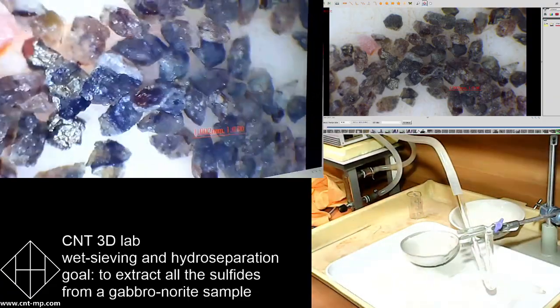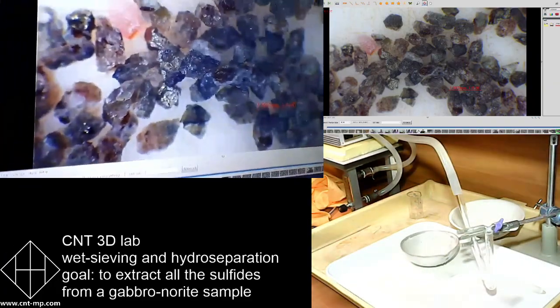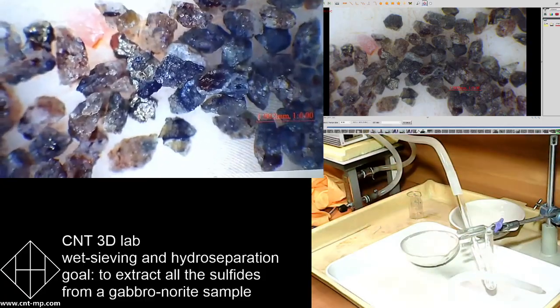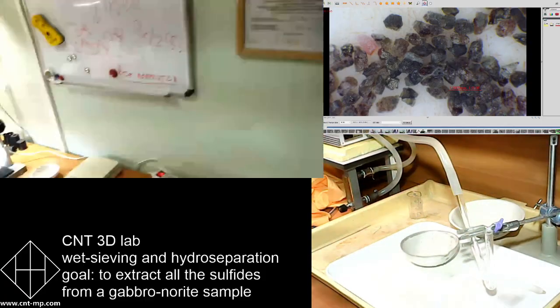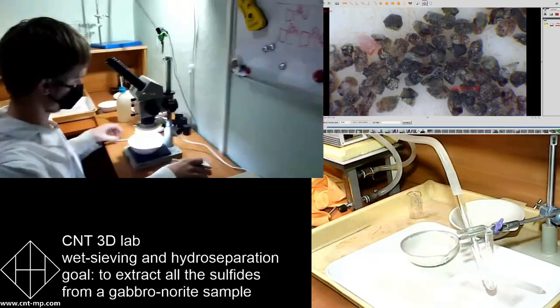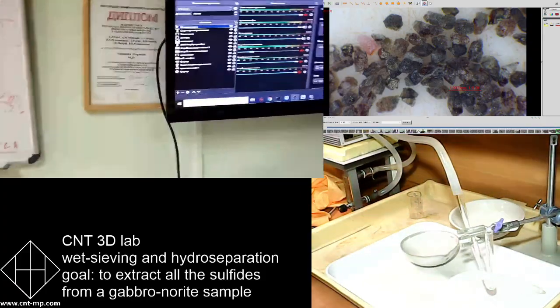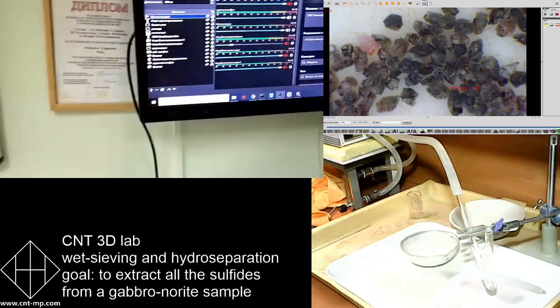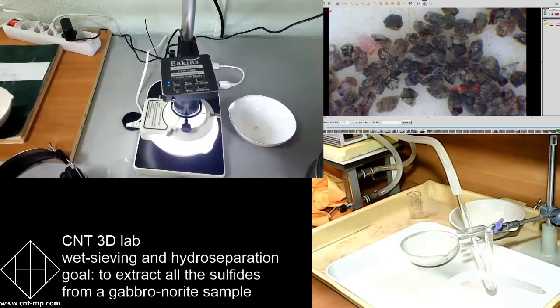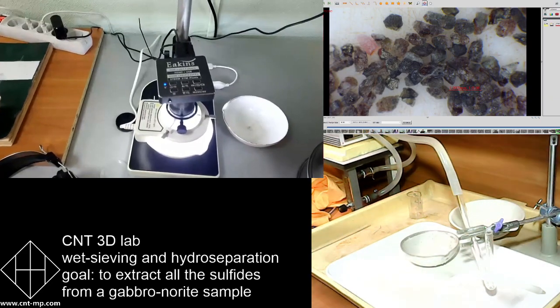Yes, that's the pyrite, right? What is it? Yeah, there are a few sulfides there, you can see. Just pyrite, that's just pyrite. But you can see the outlook. You can see how crystalline these are. They are ideally preserved. Nice particles of pyrite. You have seen that sample. There is no way that you can recover these pyrite crystals any other way, because it's electric pulse which allowed us to extract it as pristine crystals of pyrite.